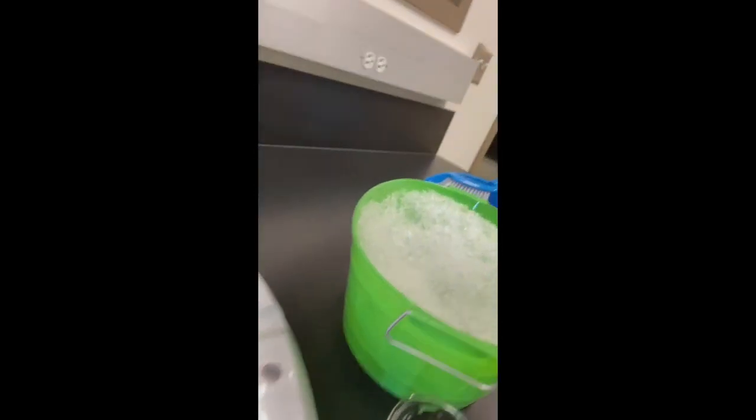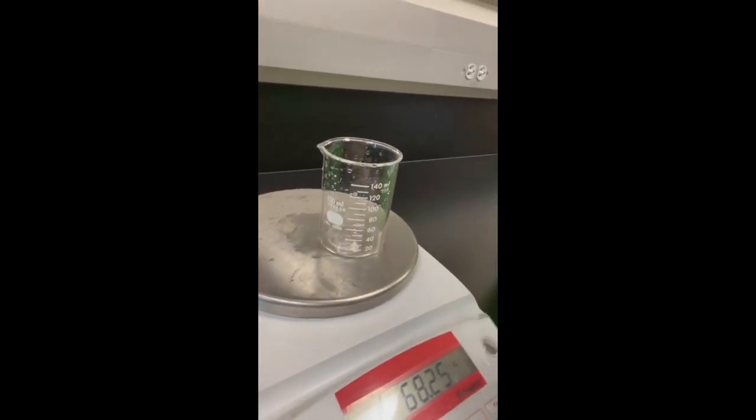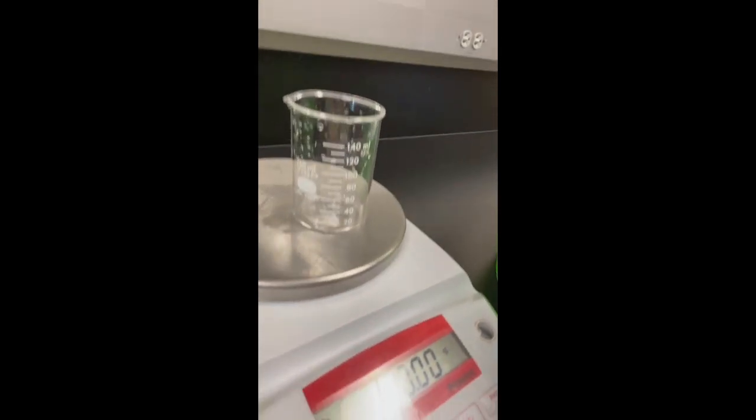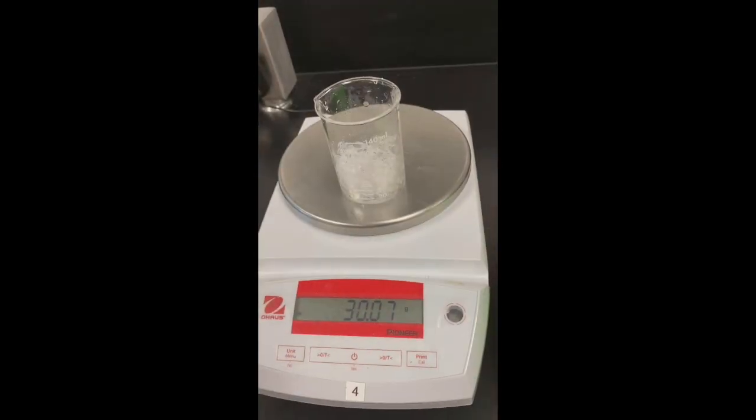Now I'm going to measure out 30 grams of ice in a 150 ml beaker. I've got my ice and my scale here. I'm going to tear out the weight of the beaker by pressing tear. So that zeroed out for me, and I'm going to add ice, 30 grams. There's my 30 grams of ice.